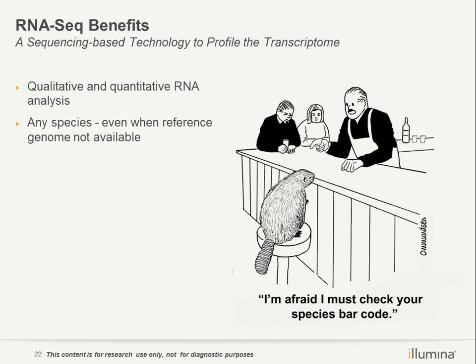for these species, which are rarely studied by researchers, you cannot find a workable microarray with all of your needed information. But with RNA sequencing, you can just sequence the transcripts and get what you need. So it does not depend on the availability of microarray products.